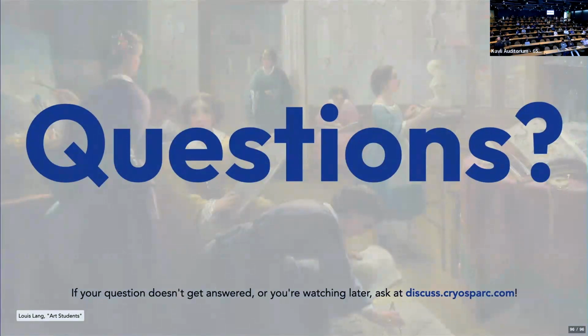Yeah, so I have a question about when you talk about the defocus. Does it make a difference if you just take one focus value and collect with that, or do a range of defocus values? But then if you do a range, how do you then put it back together?